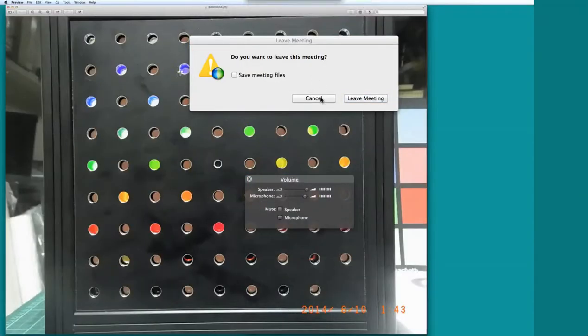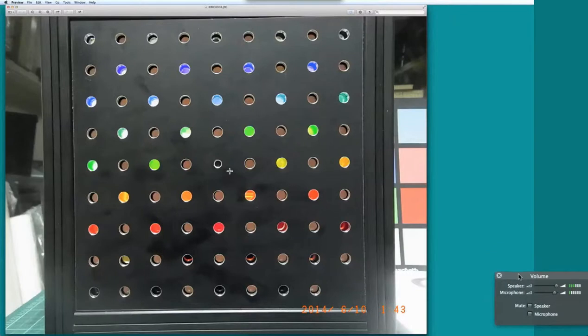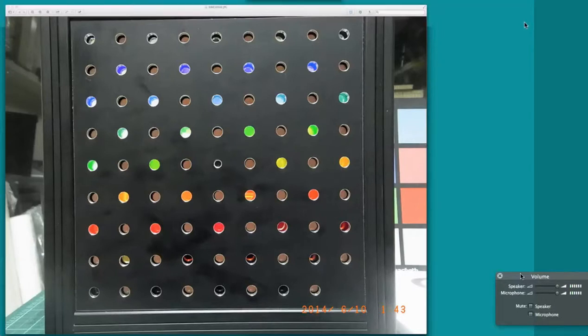So this is a picture that you have sent us yesterday. And you see that there is a distance. So this front plate that you see can be removed. In the center of the plate you have a little knob. You can touch it and pull it a little bit so that you remove that plate. On this image the knob is not visible, so you must put it into this hole. A little knob made of aluminum, which can be screwed into this hole in the middle. So this plate should be installed for calibration and should be removed for measurement. Okay.